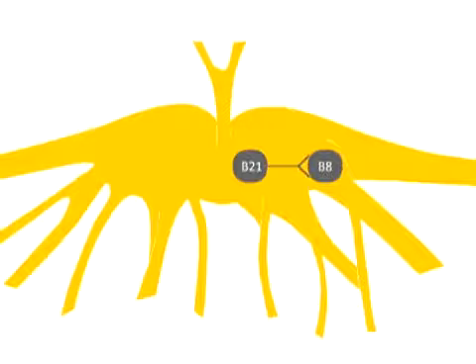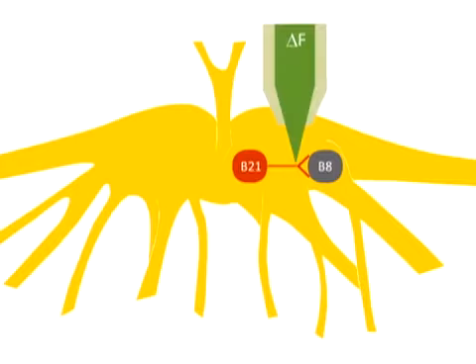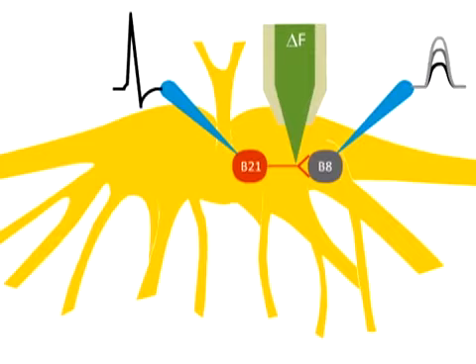To detect intracellular calcium, we will inject a presynaptic neuron with the cell-impermeant calcium indicator dye, calcium orange. The preparation is then moved under a microscope and pre- and postsynaptic neurons are impaled with sharp electrodes. Repeated presynaptic stimulation results in an enhanced postsynaptic response, visible as increasing postsynaptic potential, or PSP, amplitude. Measuring the fluorescent signal of the calcium indicator dye will allow us to detect simultaneous changes in presynaptic intracellular calcium.